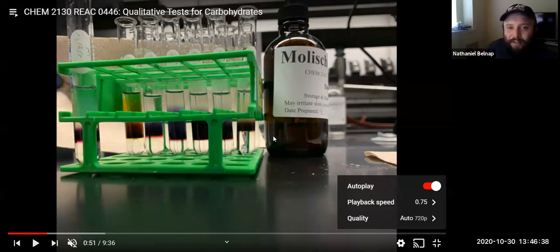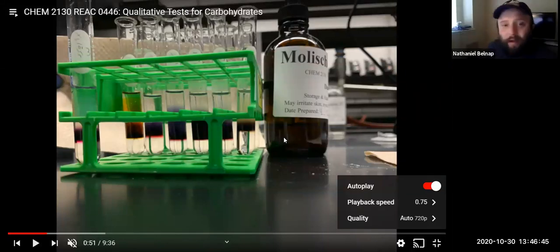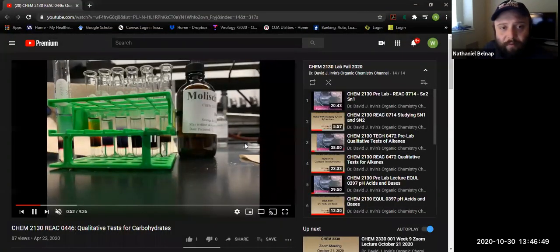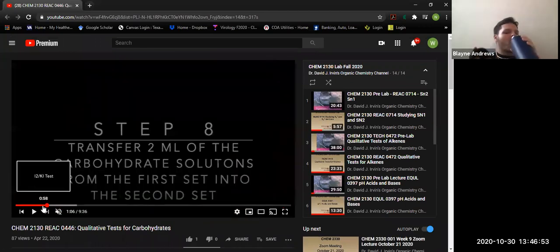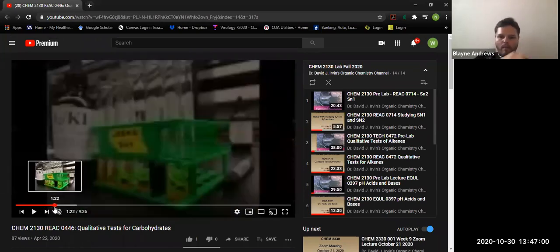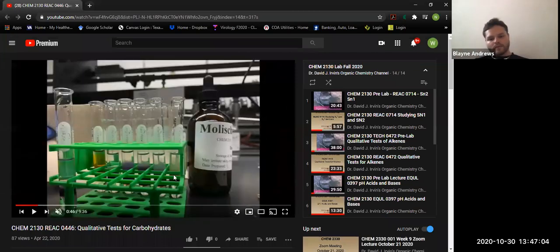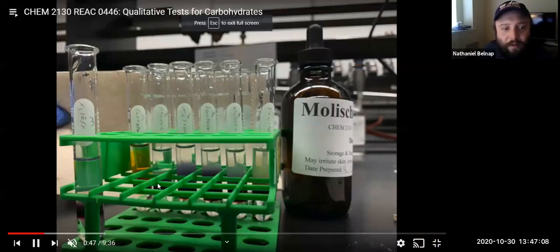I would say it's positive. Okay, and which one again? It's fructose. Yeah, that one was fructose on the end there.